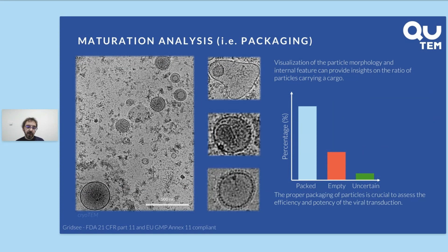And once again here, TEM is a very powerful tool in that you can really not only look at the data, but actually relate the data to the image and therefore to your particle. So packaging is something that is typically performed using cryo-TEM, since in negative stain it's very hard to see inside the particle.